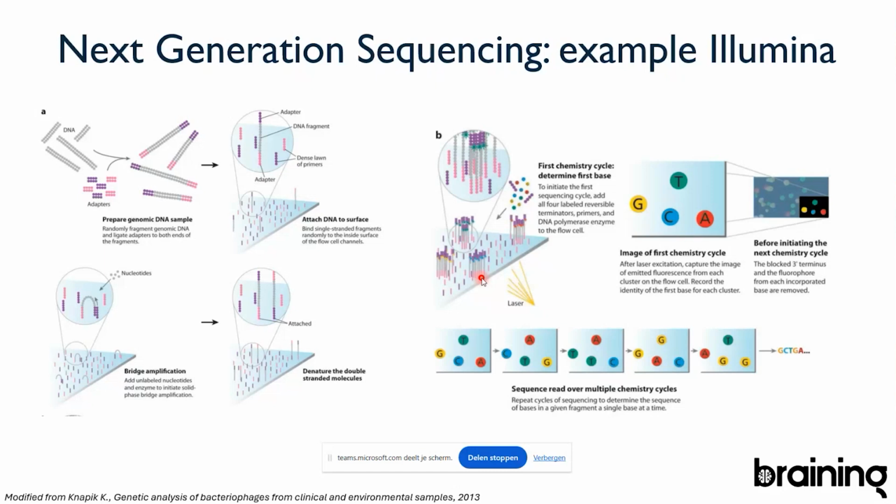Okay. However, I have not talked to you about what's actually happening before. Both for Sanger sequencing and for this next generation sequencing, there is an optimal length, which has to do with the technical limitations of the machine. Basically, this length of DNA is approximately 500 base pairs.